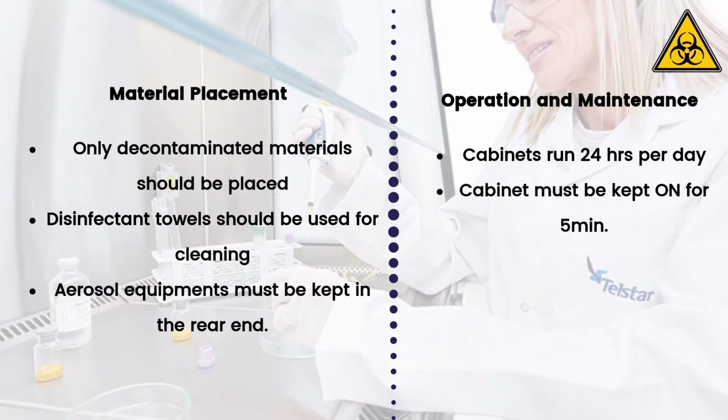Before starting and after completing the work, the cabinet must be switched on for 5 minutes. Keeping it on for 5 minutes after completion is for cleaning and decontaminating the cabinet workspace. Qualified personnel are required to perform any repair in the equipment.